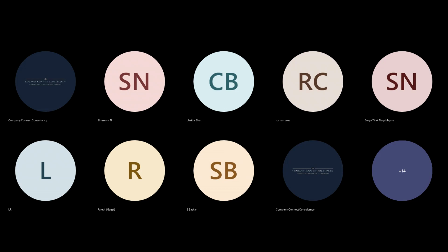Okay, E5 is a master who has 30 years of development experience in LIMS. If I teach you, I can take you to one proficiency level, something between E1 and E2, which is quite good. Not only from the front end, but how the tables are built, how the table structures are related, how to build the master data.